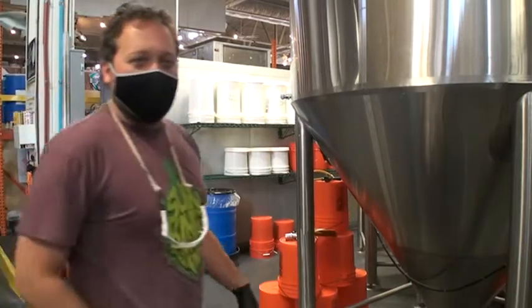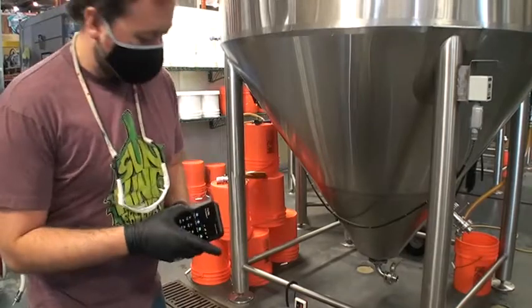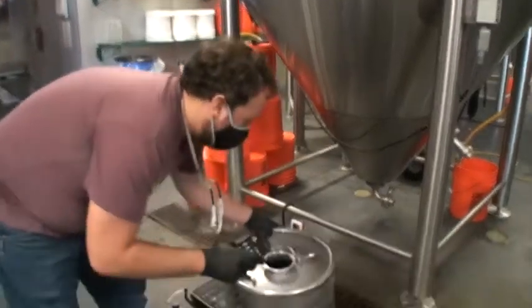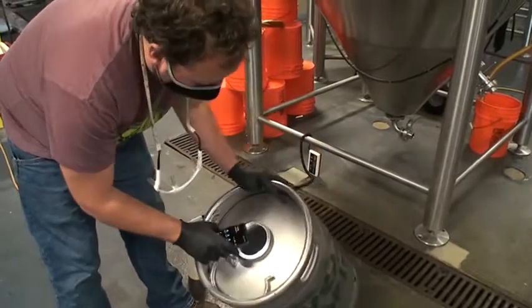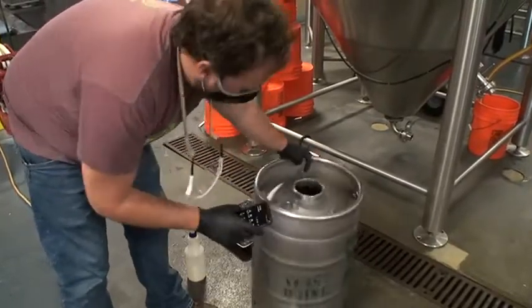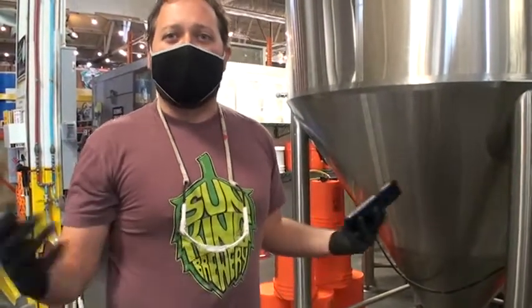And then I want to inspect inside the keg. So I get a flashlight out and look in here, all the way around. Just a visual inspection. Yep, just to make sure there's no yeast matter or protein matter or something that got stuck to the inside of the keg that didn't get clean.